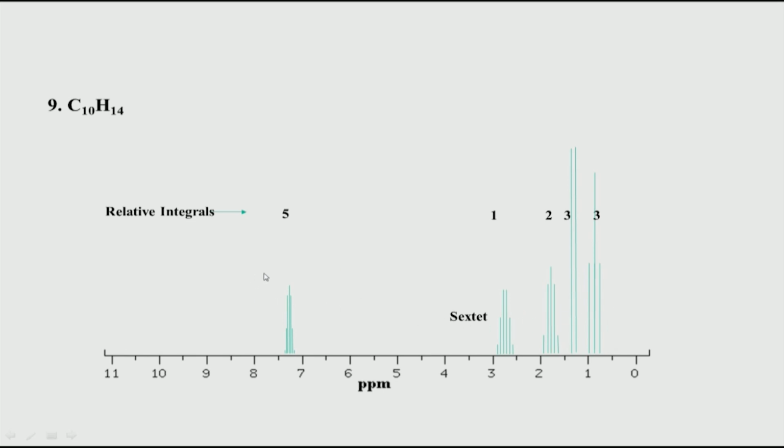So, what we typically do is bunch all the aromatics together and get a common integral value for that. The presence of peaks already tells us there is an aromatic system, plus the integral under this together gives the total relative integration value, and that tells me that there are 5 protons. So, essentially it means there is a phenyl ring, the benzene, the phenyl group, and that is why there are 5 hydrogens. That is how we interpret this side.